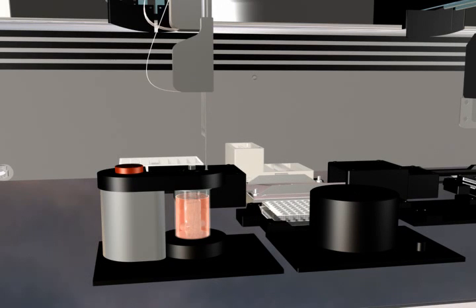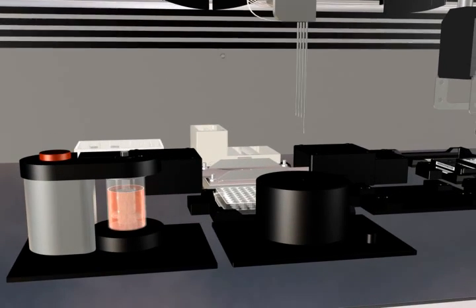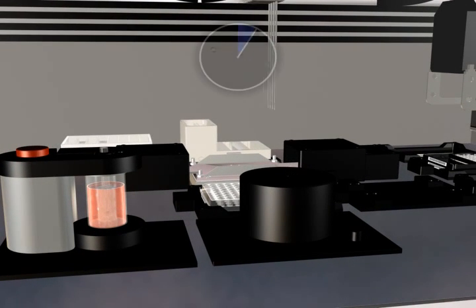Meanwhile, the onboard cell preparation station keeps the cells in suspension. This feature provides at least 4 hours of unattended operation.